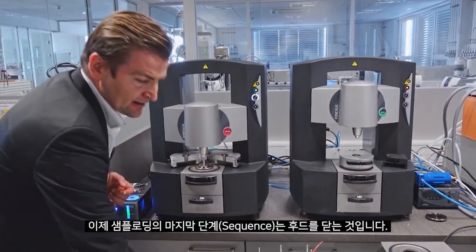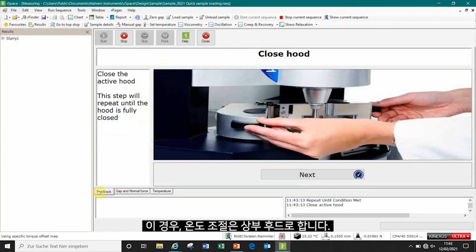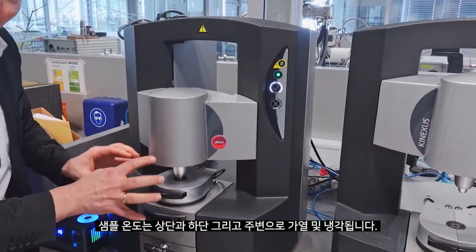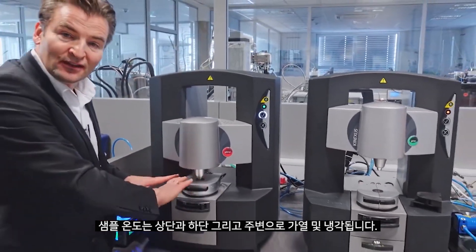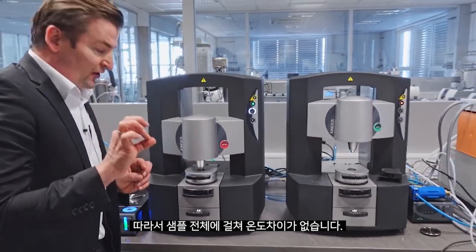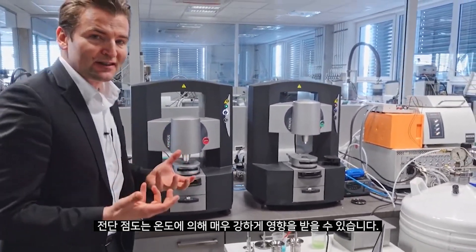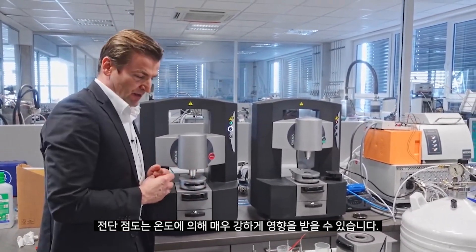After trimming we go down to the target gap of our cone. You can see in the software screen that we are monitoring the full history of our sample — which forces are acting, and at which times the pre-shear history can affect the results. This is fully monitored on the Kinexus and can later be stored and analyzed. The last step in the loading sequence is to close the temperature control hood, so the sample will be heated and cooled from the bottom, top, left, and right, ensuring no temperature gradients across our sample, because viscosity can be very strongly influenced by temperature.